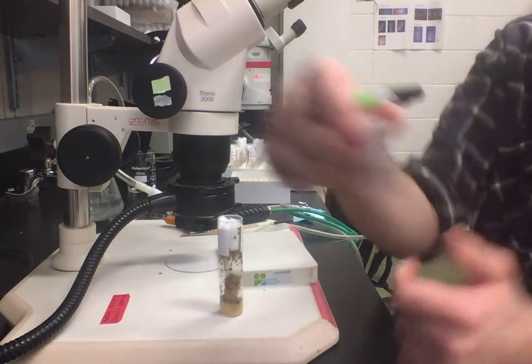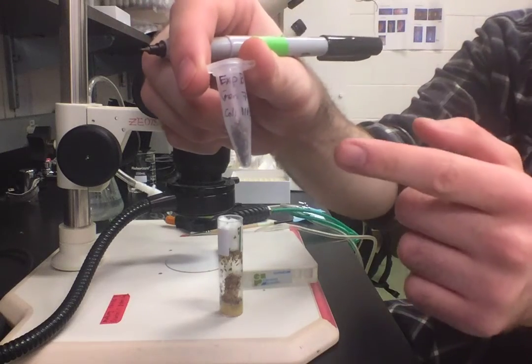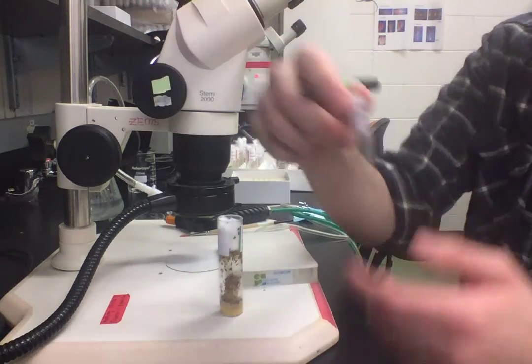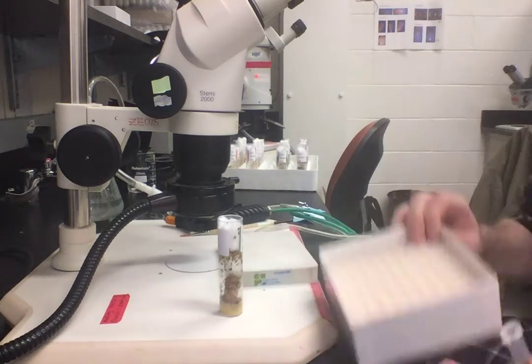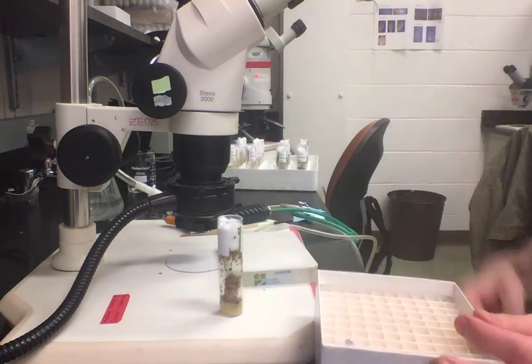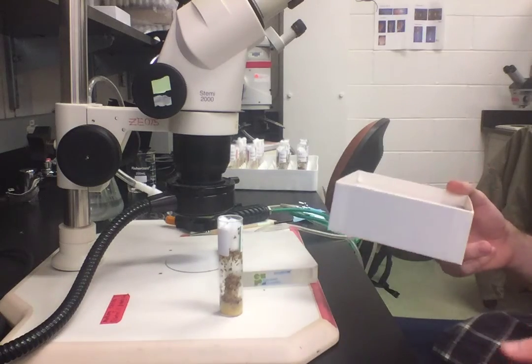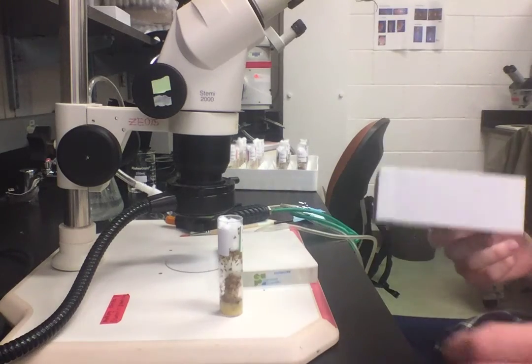I've got on my vial the treatment, the generation of the flies, and the date that I collected them on. Then I'm going to take one of these white cardboard freezer boxes and put all of my vials in here. Then I'm going to put this whole box into the negative 80 once I've collected all my flies.